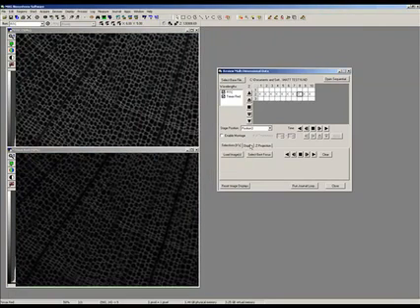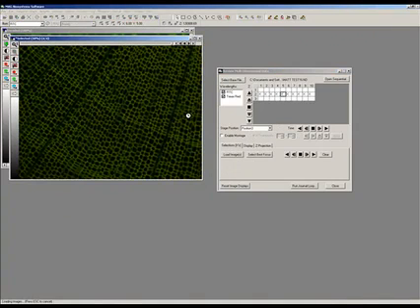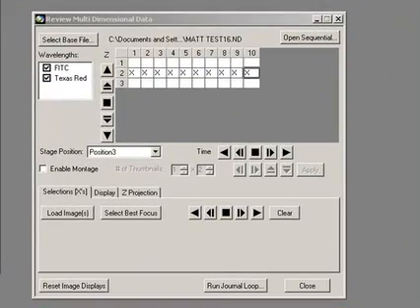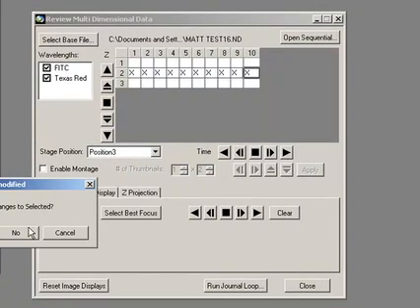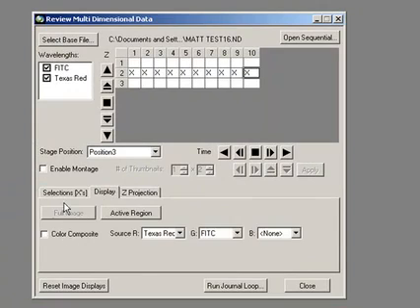If I want, I can obviously do that with my composite on and do the same thing. Load image. So there is my color image at position 2 out of 3 in Z over time. So the extraction is pretty straightforward. I'm just going to turn my composite off.